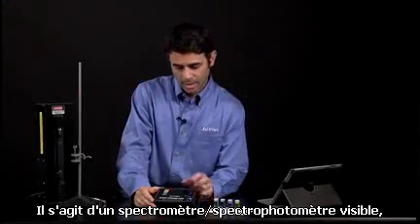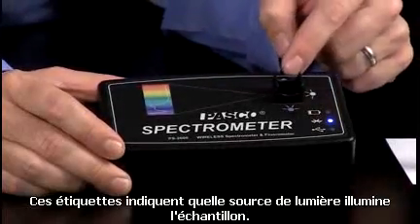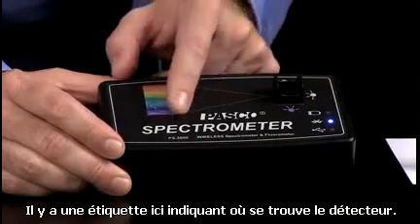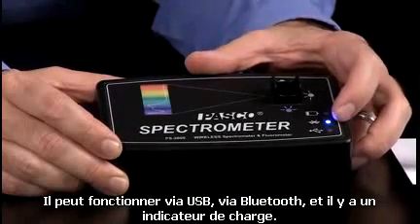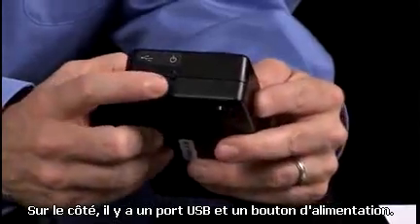This is a visible spectrometer, and you'll notice from the box that there's a cuvette holder. The labels indicate the light sources that can illuminate your sample, and there's a label indicating where the detector is. It can work via USB, via Bluetooth, and there's a power indicator. On the side, there's a USB port and a power button.